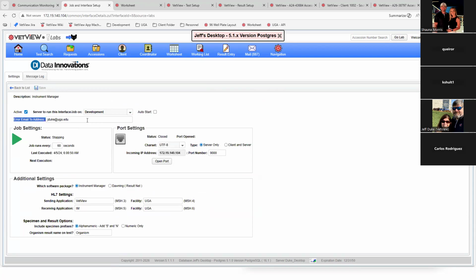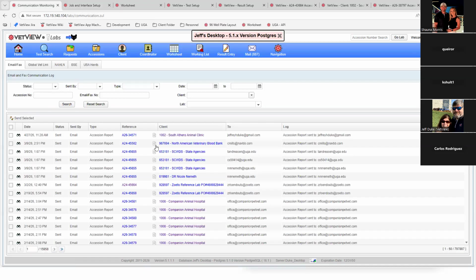Hey, this failed, and they'll give a little bit of detail about why it failed. Is the interface down, or is there something not working anymore? That way you can proactively know to go check something, see why it's failing, or help potentially correct that problem in the system. So we have both those things, the per message events, and we have that screen that lets you also manage that and view that at a higher level in the system too.